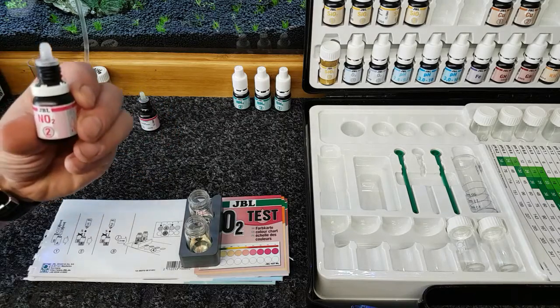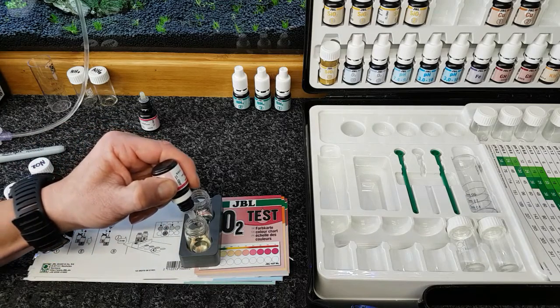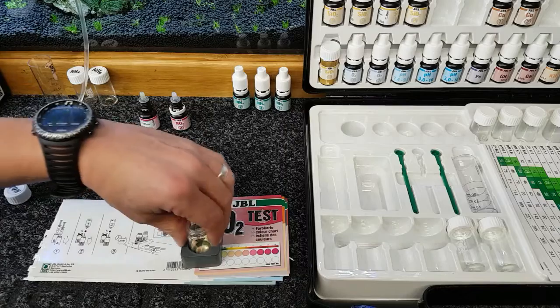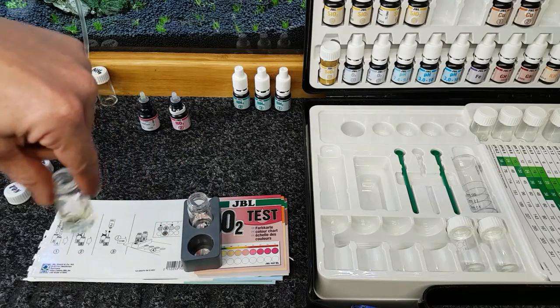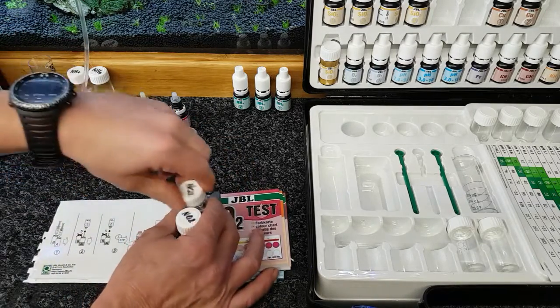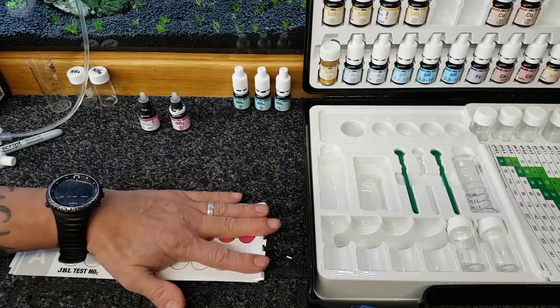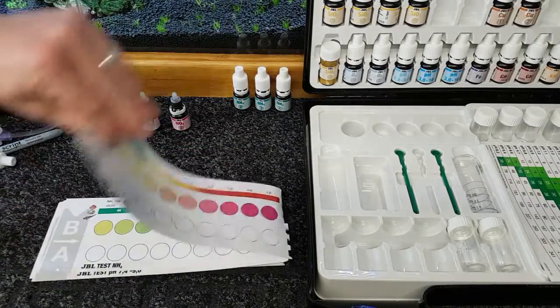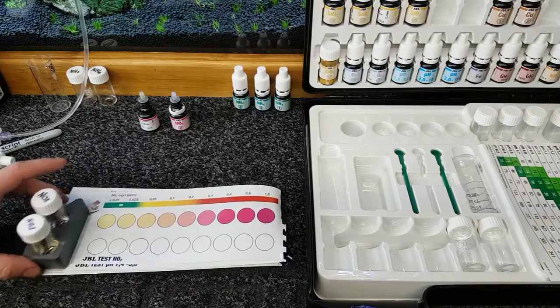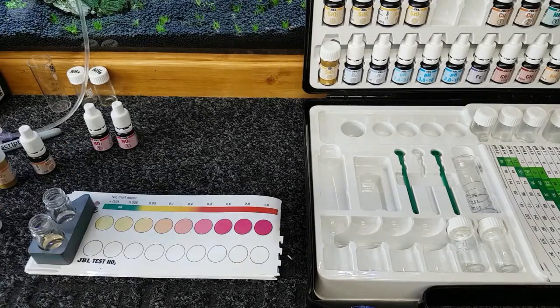And then we got the NO2, which has been shook up as well. And we put 5 drops of that in there as well. Number 5. Take that out again. Swirl him around. Put our lids on. And then we can just turn the page over. And we got to wait 3 minutes for that one. So we can put that on our block. Give that another little stir. And wait for 3 minutes.